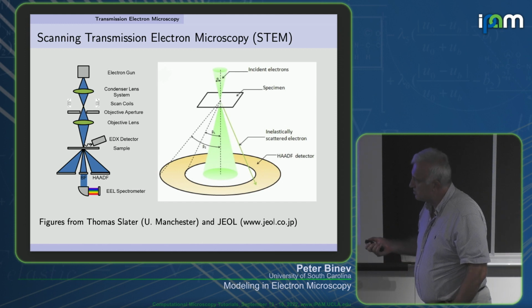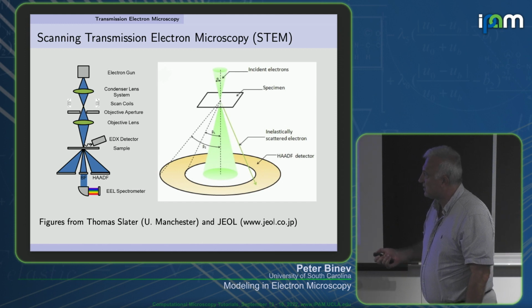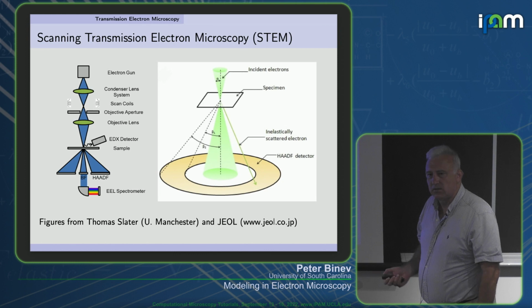In addition, which I will probably talk about in my other talk, there is some other information. This is an EDX detector.